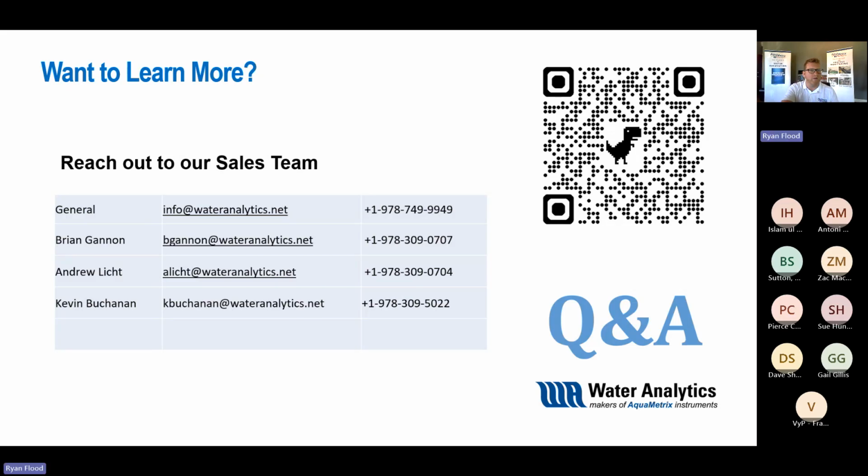Someone asked, what do you mean by a blind transmitter? A blind transmitter, for those that might not know, is fairly common. It could be a blind transmitter, blind analyzer, or even a blind controller. Basically that means you don't have a visual display on the device itself. It's performing all the actions behind the scenes. The only way you'll see how it's operating is to tie into its operating system behind the scenes, which would be different from controller to controller.